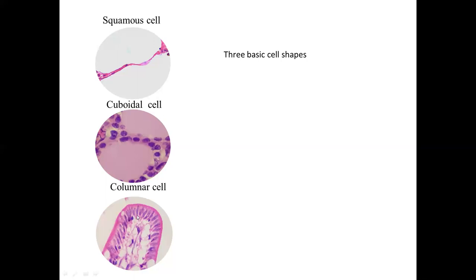The long axis of the elongated nuclei is perpendicular to the basement membrane, which lies below. Below the basement membrane, you see connective tissue, and on top there is a slight hazy appearance — that is the brush border or microvilli. Here you can also see a goblet cell. In this practical, you need to be able to identify the columnar cell properly and identify its elongated nucleus.